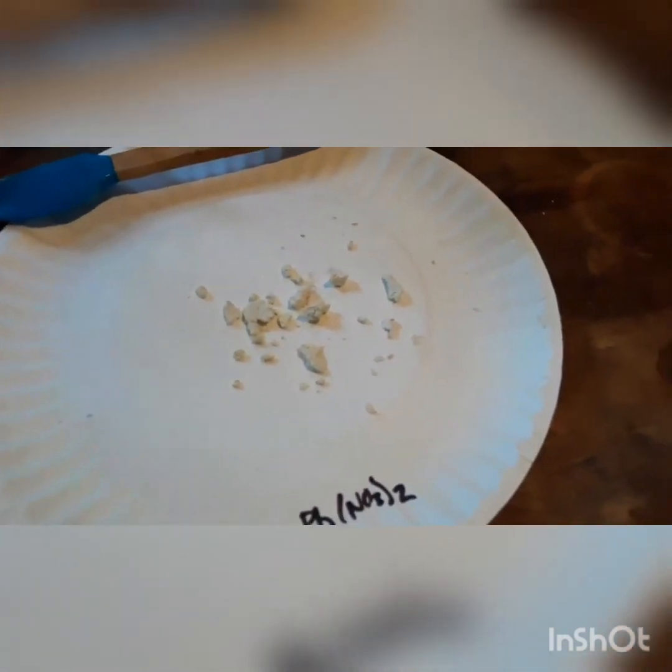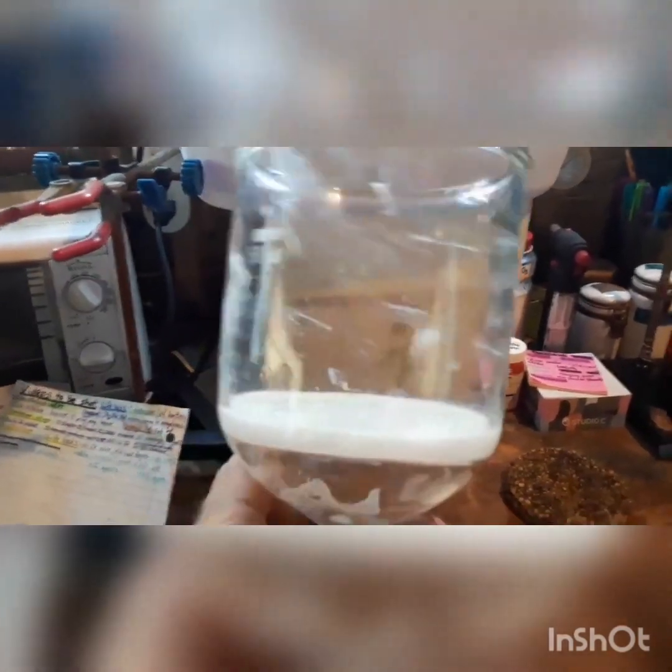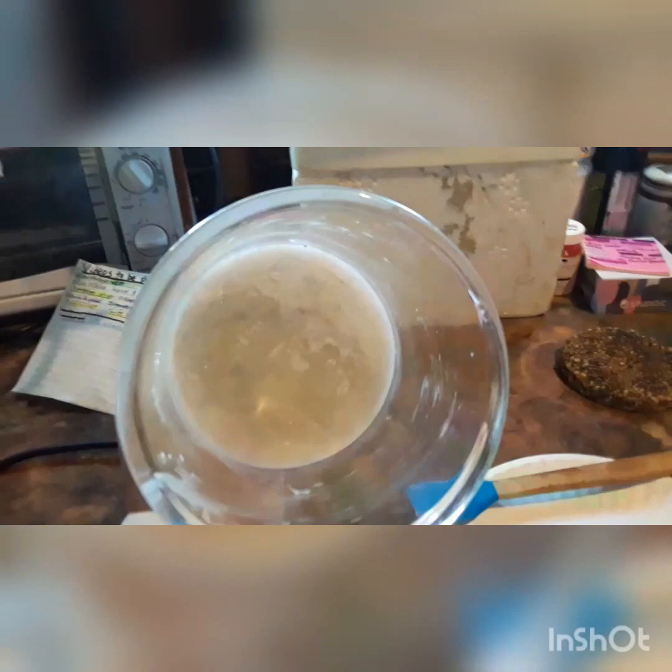The only thing you guys really didn't see in the vacuum filtration step was I gave it a couple of washings with cold distilled water. The reason I use cold water is because lead nitrate is actually fairly soluble in water; however, the solubility curve increases dramatically with temperature. So the colder the water is, the less product you are going to lose through the frit when you add the water to it. Cold water is best. Here you can see what the filter looks like — I got it pretty much as clean as I can get it.